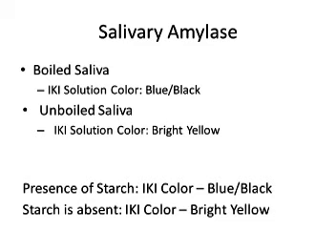However, if starch is absent, the color would be a yellowish color. Comparing your boiled saliva versus your unboiled saliva, you would notice that in the boiled saliva, the IKI would stay blue-black the entire time. Well, that's supposed to happen. It might not have happened in your specific experiment during lab, but that's the ideal.